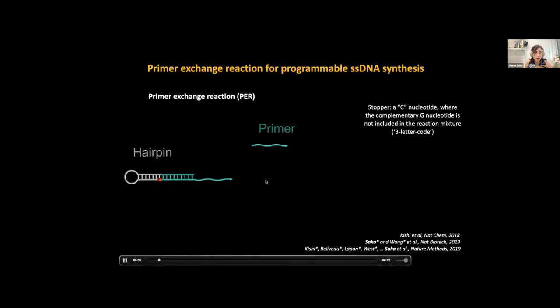I mean, it's just a small animation. So we have the primer binding and a polymerase. This is a strand-displacing polymerase, and it starts to extend using the template. And there is self-dissociation through a branch migration process. And this process repeats in this tube over and over at the same temperature, and every time adds one more unit sequence of the primer in there.